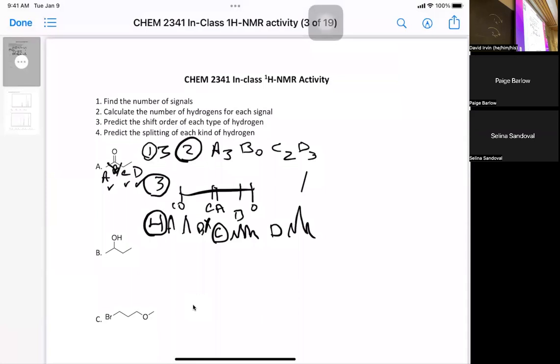Can you go over the peaks again? What do you need, the peak order or the peak types? Okay, so they have special names, but you have to think of one peak as a singlet, two peaks as a doublet, and they're going to be equal height. Because you're just taking the one peak and splitting it into two. Now when you split it into three, the one in the middle is going to be higher, and the other two are going to be about half height. That's called a triplet, 3 peaks.